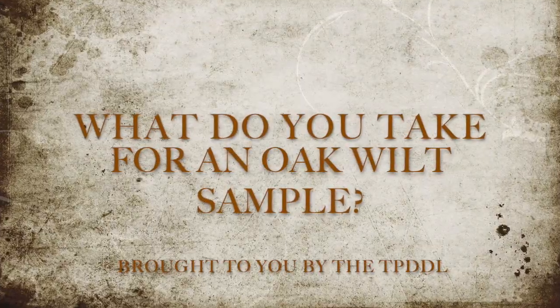If you might be suspicious of oak wilt in your tree, please watch the rest of this video to see how to take a sample. Today we are asking the question: what do you take for an oak wilt sample?